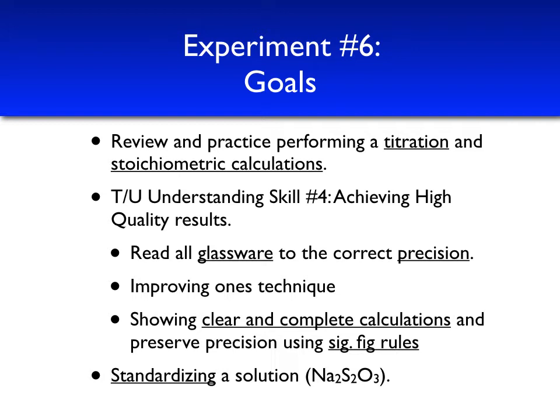We'll accomplish this by making sure all glassware is read to the correct precision, namely our burettes during our titration. We'll improve our titration technique as we do multiple trials. And we'll also practice showing clear and complete calculations that preserve precision using our sig-fig rules. Finally, we'll take a look at a new technique, standardizing a solution of sodium thiosulfate.